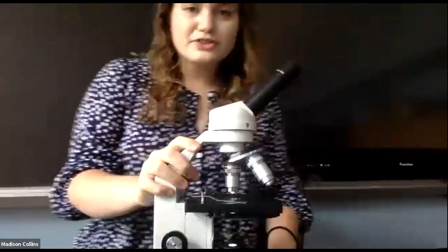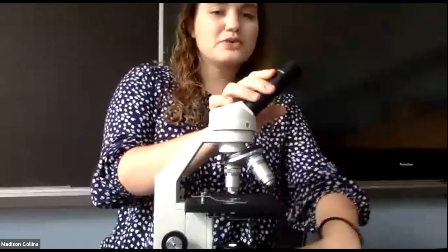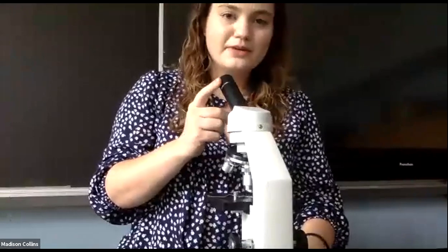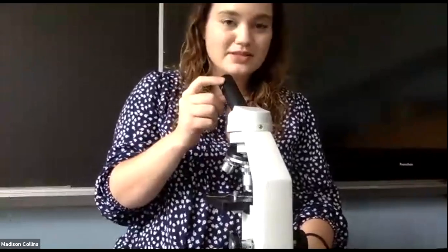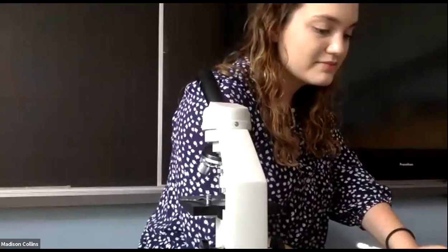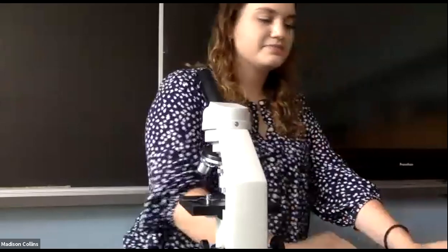So the very first thing that is on your picture to define is the eyepiece. This is going to be your eyepiece up here. When you're using a microscope, the eyepiece is what allows you to view the specimen. And something important to note is that your eyepiece has a lens in it which automatically magnifies that image 10 times. So we're always going to count our eyepiece as a magnification of 10x. So you probably want to write that on your paper. I'm going to write it on mine. So your eyepiece has a magnification of 10x.